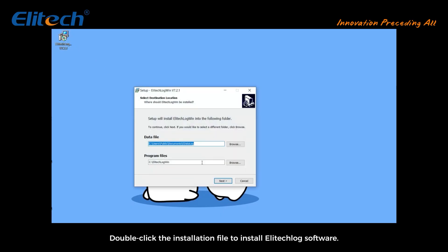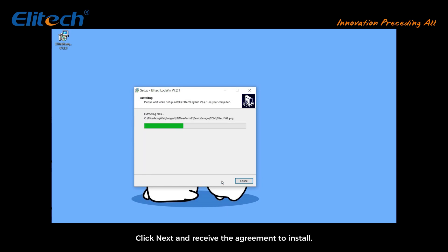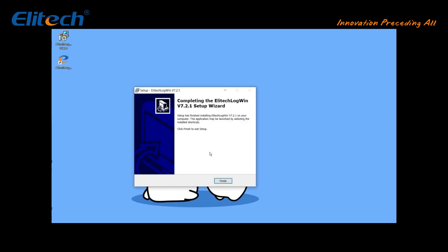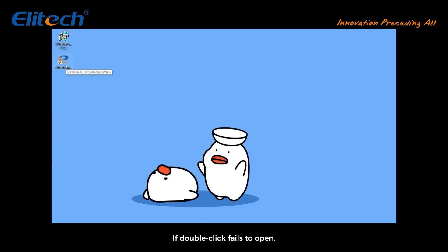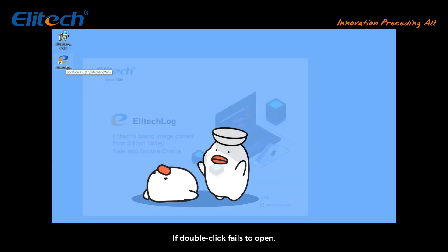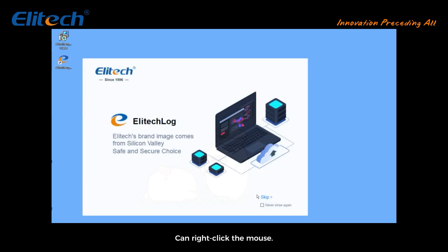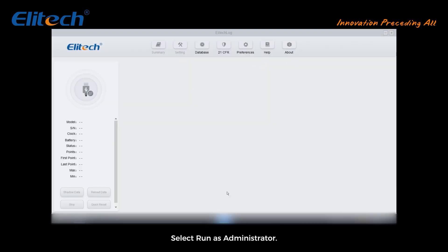Double click the installation file to install ELatec Log software. Click next and accept the agreement to install, then go back to the desktop. Double click to open ELatec Log. If double click fails to open, right click the mouse and select Run as Administrator.